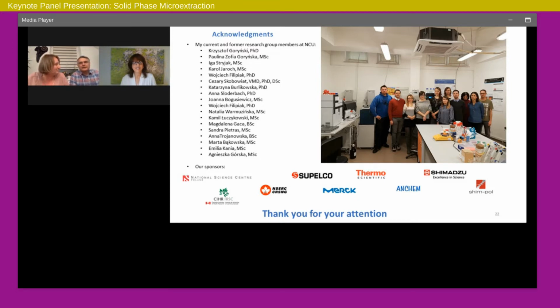Basically, SPME is a very simple way of performing sample preparation. The future is bright. The issue is it's a new kid on the block. So, in fact, it's kind of related to the previous question. Anything new looks very difficult because the device looks different, the procedure is a little different. Calibrations are not that different, but they're somewhat different in some cases. So there's a lot of reservation.